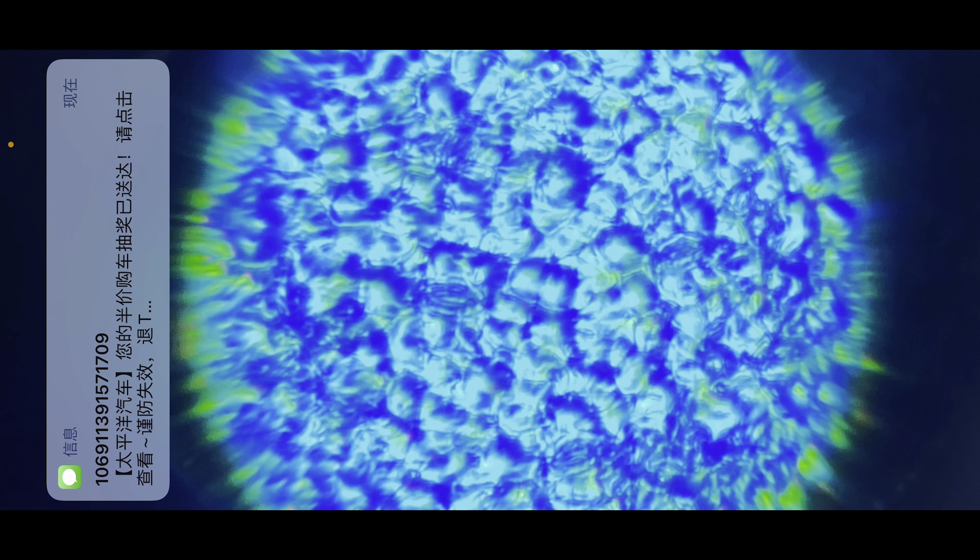When I say that things are magical under the microscope you guys should believe it, because look at this. This is what I see — but not exactly, because this is the photo being taken on my phone. When you actually see this under the microscope the colors are more vibrant; each outline of each bulb is kind of neon colored and also rainbow colored, due to light reflection probably. This is only 8x times 15x, which is 120x magnification.